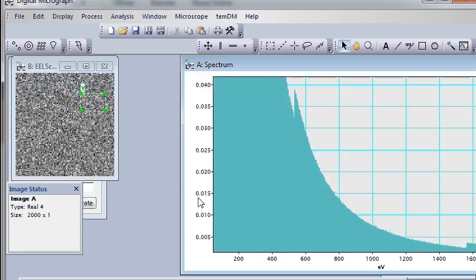So you see the spectrum is much smoother. That's because many pixels are summed up. Well, that's basically all I wanted to show you today. In the next tutorial I will demonstrate the simplest PCA treatment of a given EELS example.